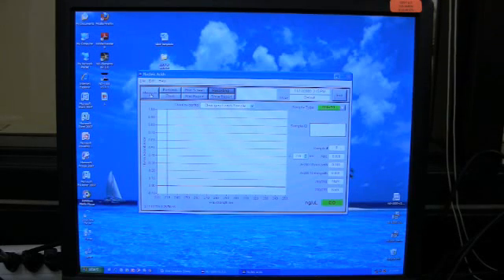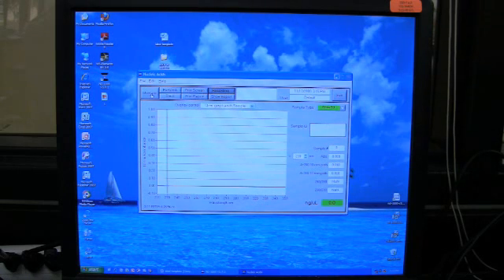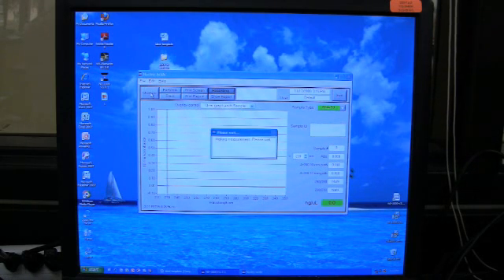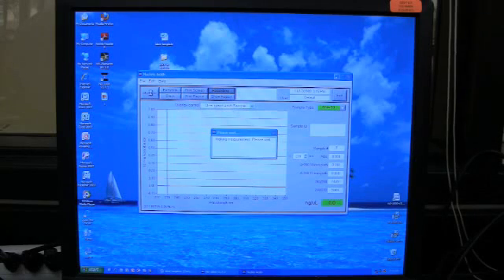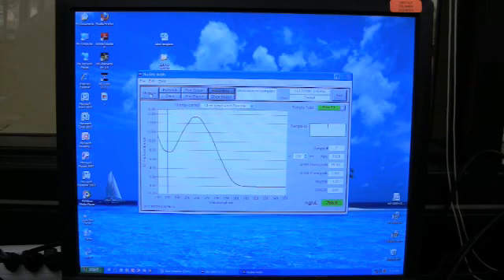Having loaded a sample, direct your attention to the control panel. Locate the button labeled measure in the upper far left corner. Click this button to begin measurement of the sample. The Nanodrop will run for a few seconds, and upon completion, a graph of the sample's absorbency will be displayed, along with pertinent data on the right. The quality can be ascertained by noting the 260-280 nanometer ratio. This value is found in the lower right-hand corner.